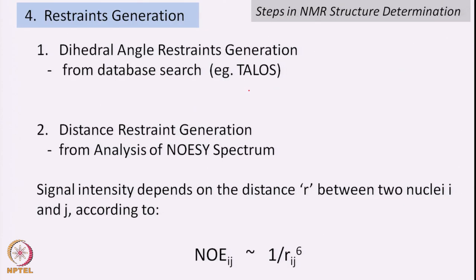Now we have got the assignment of peaks, we have got through-space correlation, and we have got some idea about dihedral angles coming from the DQF COSY. That all will be used in generating the restraints. So, these distances can be further used for calculating a structure. Two things are important. One is the torsion angle, what kind of conformation our polypeptide chain has, and the other is distance, how these protons in space are correlated.